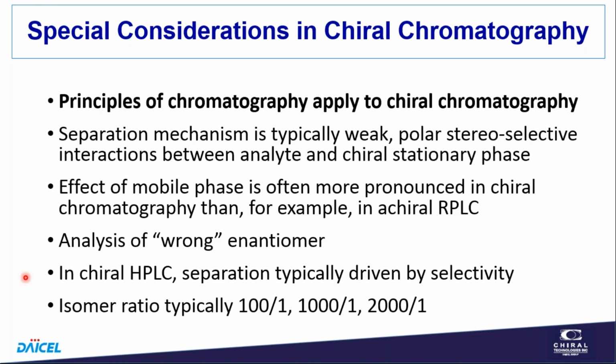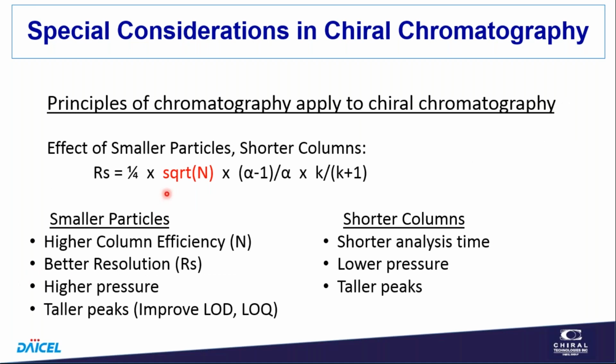So I just talked a little bit about the chromatography. I want to talk about the particle size or column efficiency. And you probably know this from achiral chromatography, that with smaller particles, we get higher efficiencies, related to 1 over the diameter of the particle. So as we go to smaller particles, we'll get higher column efficiency, which means we'll get higher resolution. But we also get higher pressure, and this certainly is the issue of UHPLC. UHPLC, as you probably know, is not really a technique. It just means chromatography run using smaller particles, which result in higher pressure.